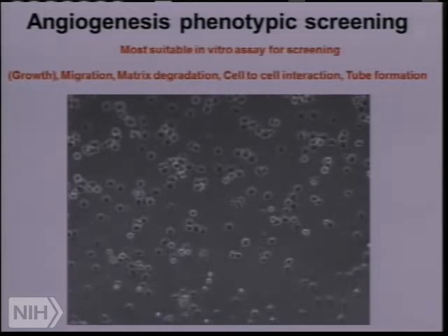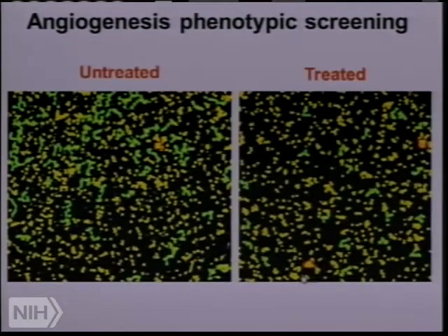And this is the tube formation assay. I'm not sure if you're familiar with this assay, but it simply consists of generating a three-dimensional gel that is composed of an extracellular matrix from a mouse tumor. So from this mouse tumor, we extract the extracellular matrix and generate these 3D gels. And on top of those gels, we add endothelial cells. So the endothelial cells are basically on their environment, on their matrix. And this is basically what happens when you do that.